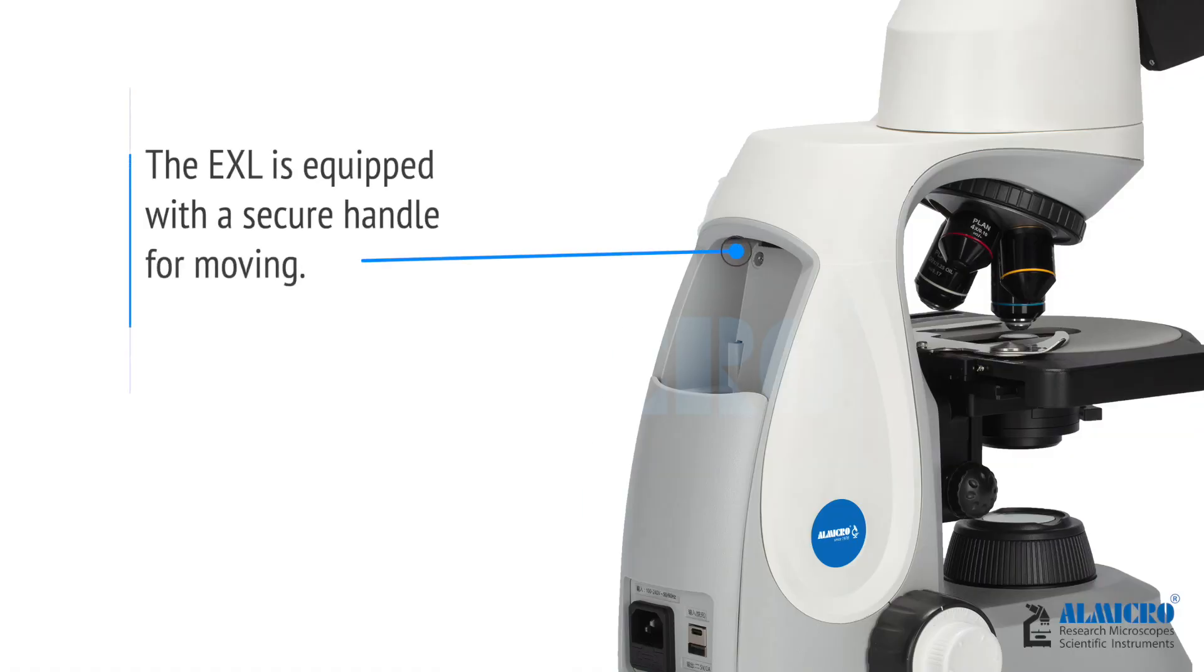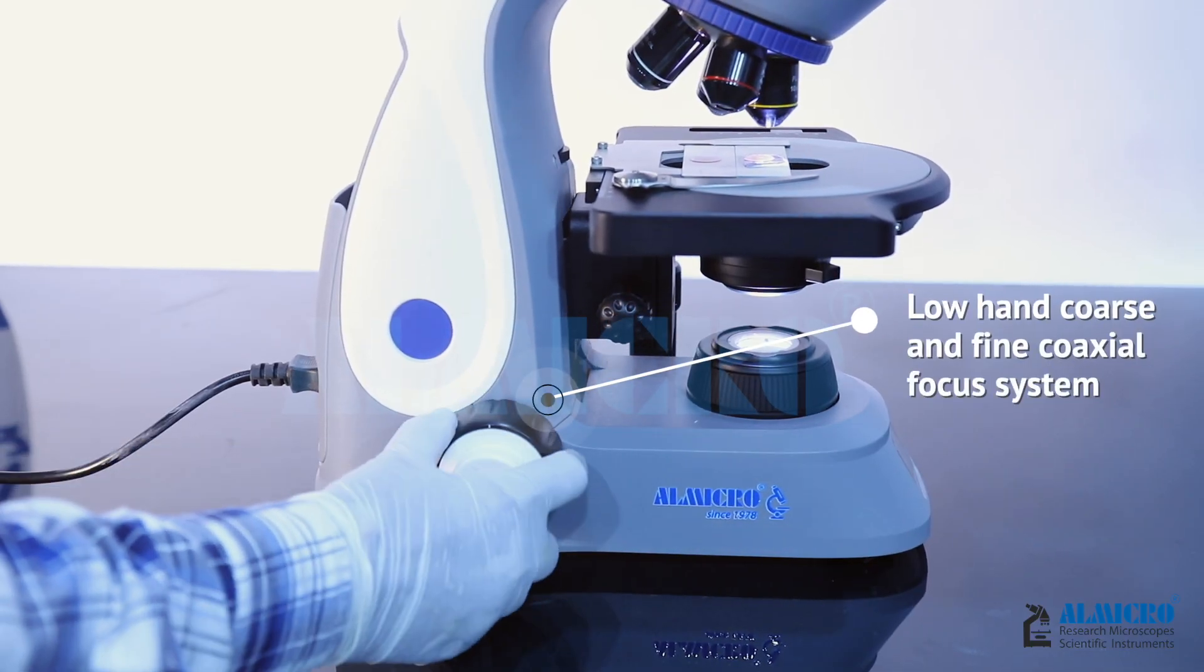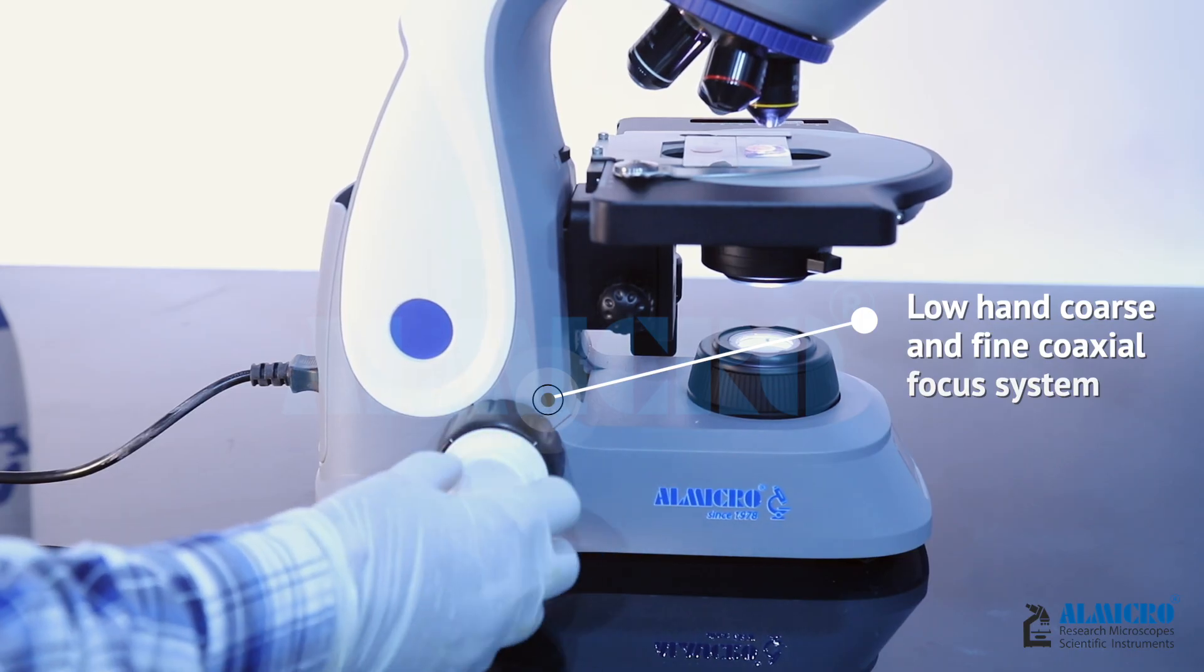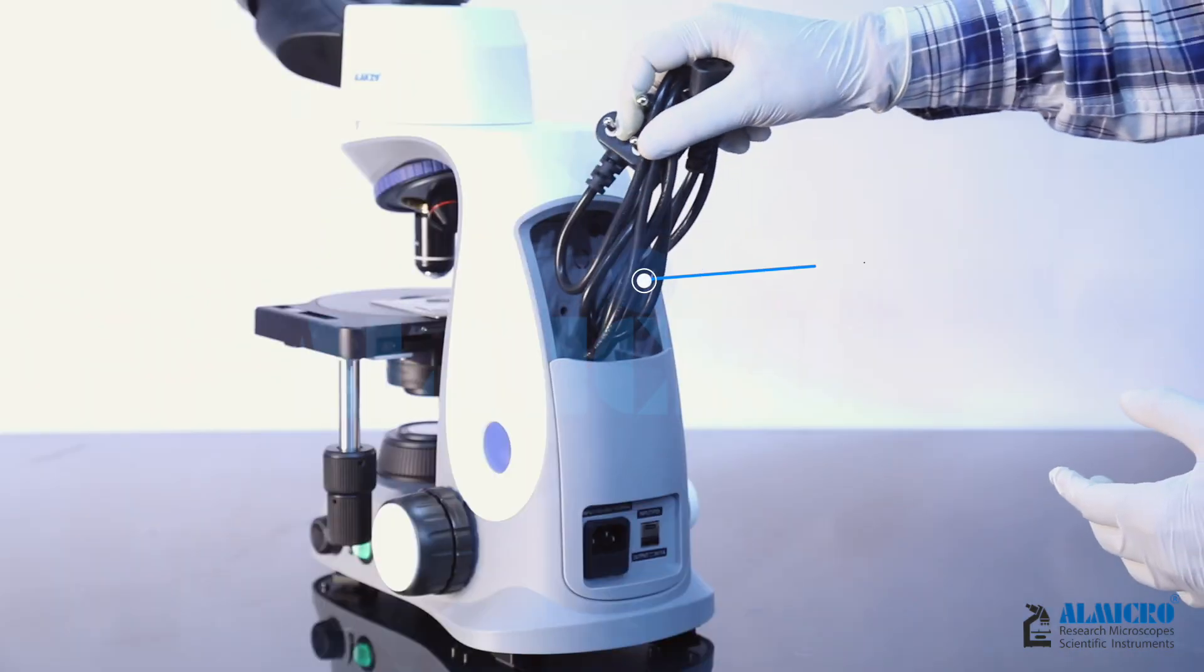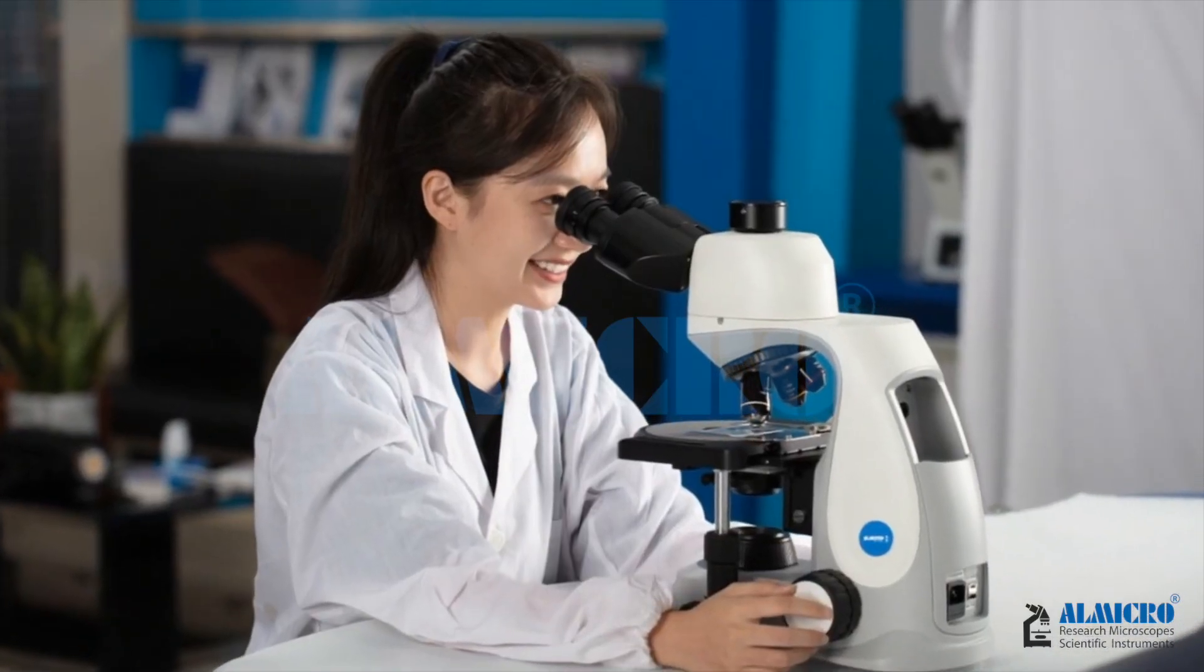The EXL is equipped with a secure handle for moving. Low hand coarse and fine coaxial focus system is ergonomically designed to give the user maximum comfort. There is a storage device at the back of the body to ensure cleanliness.